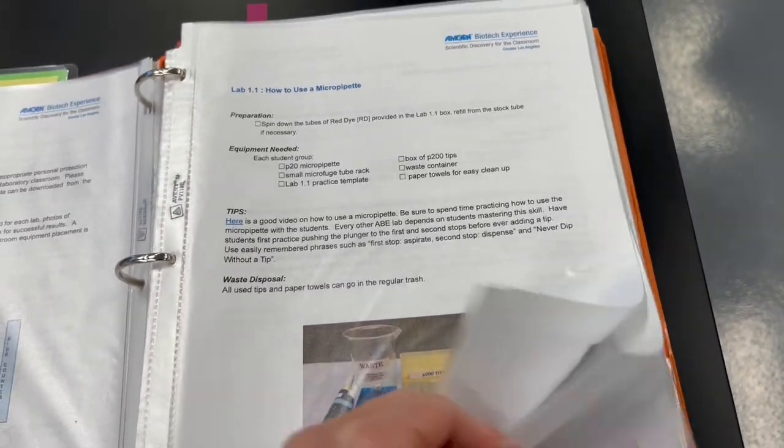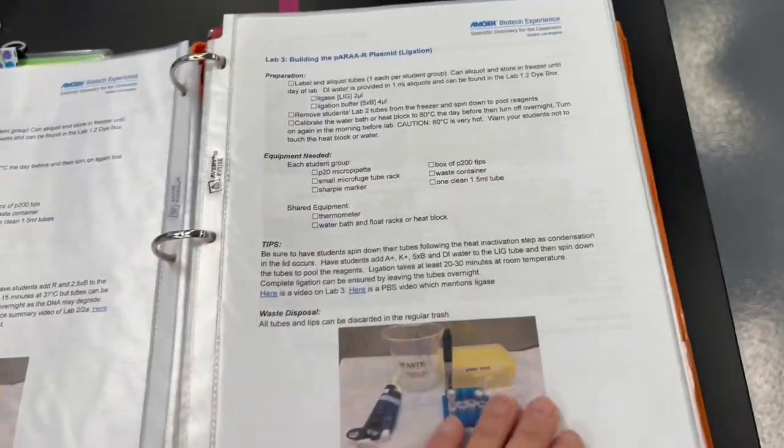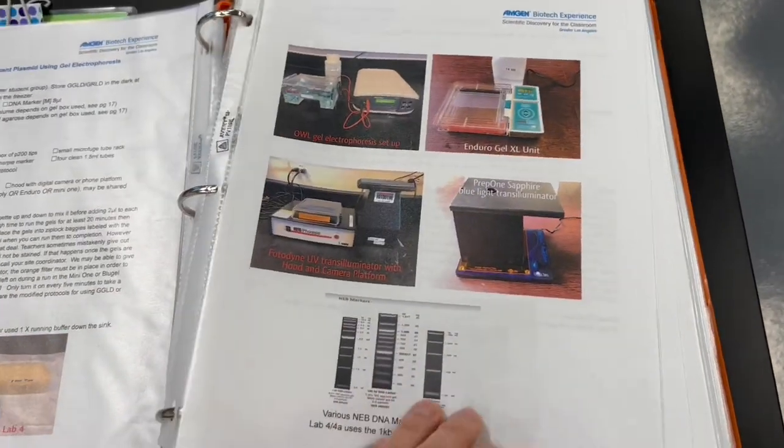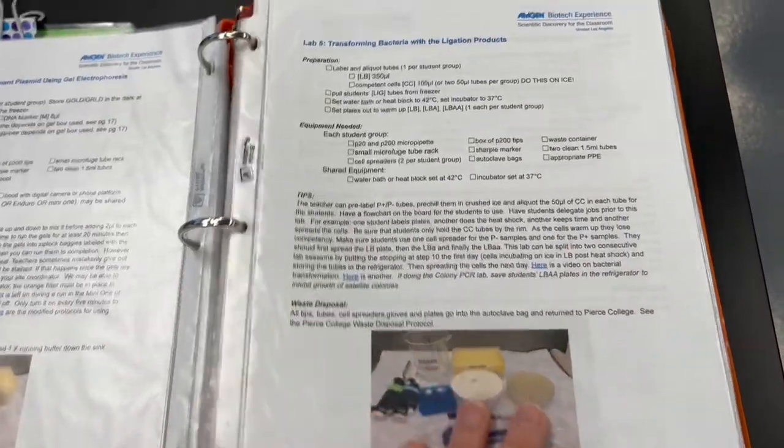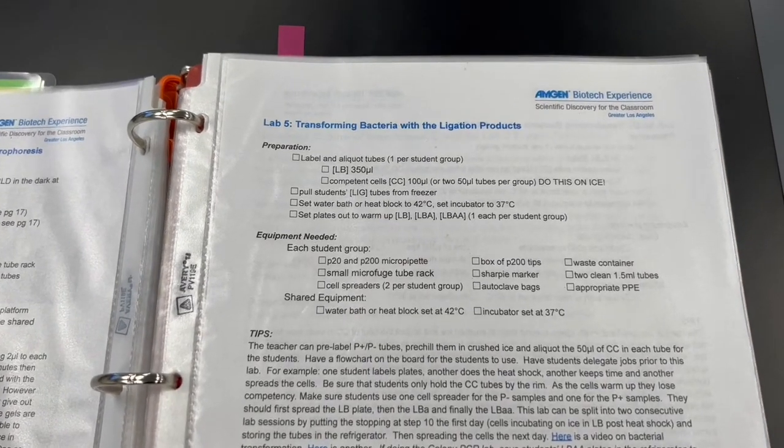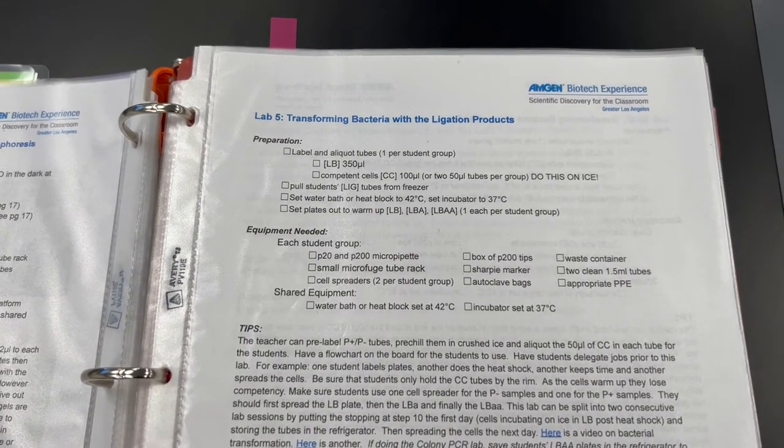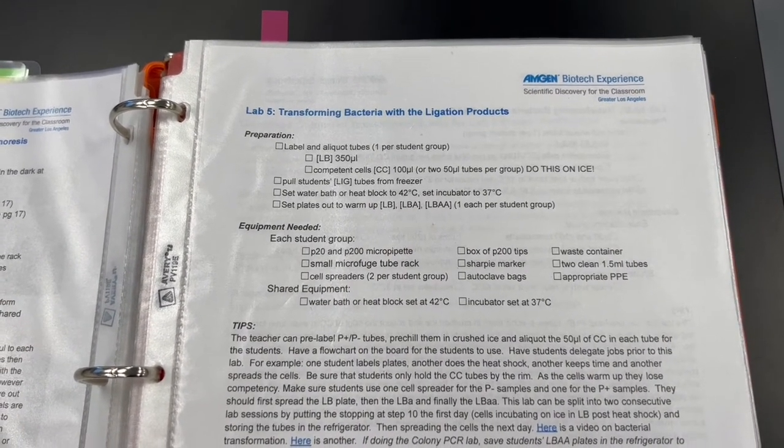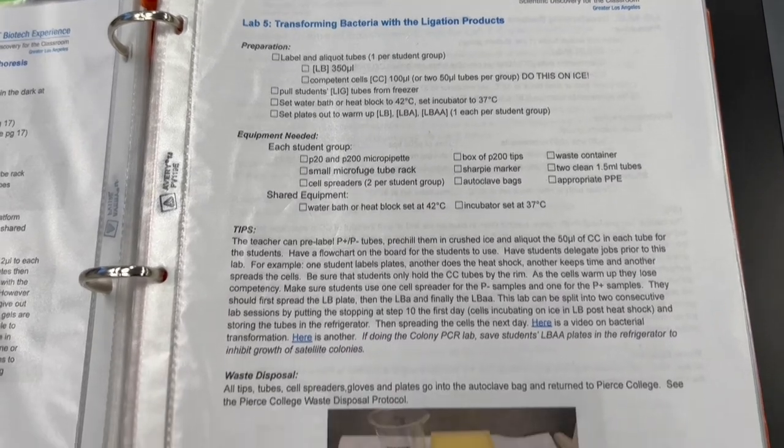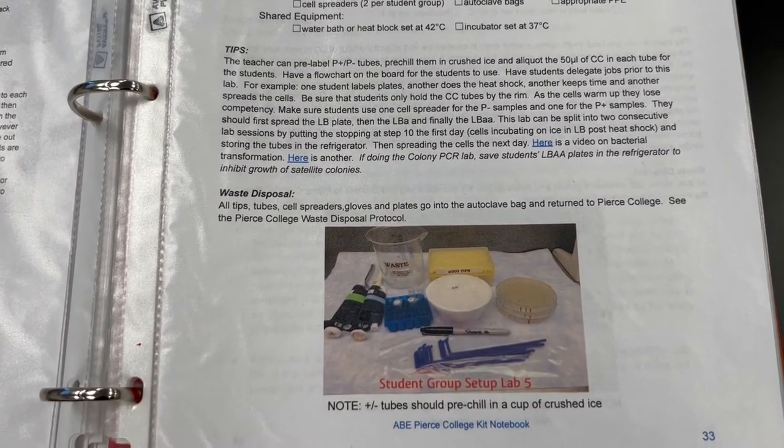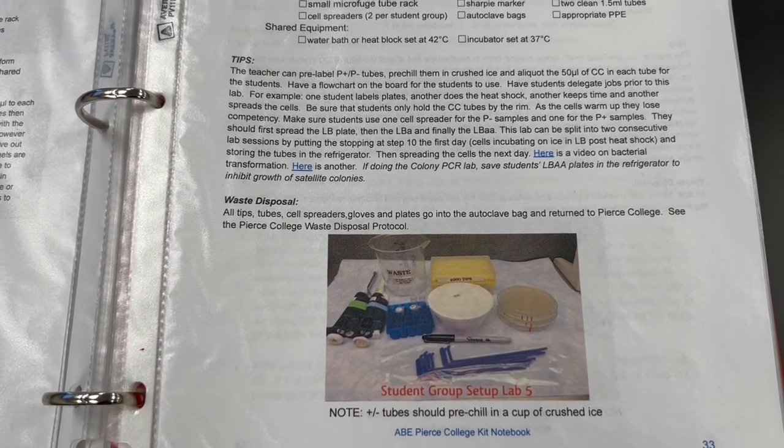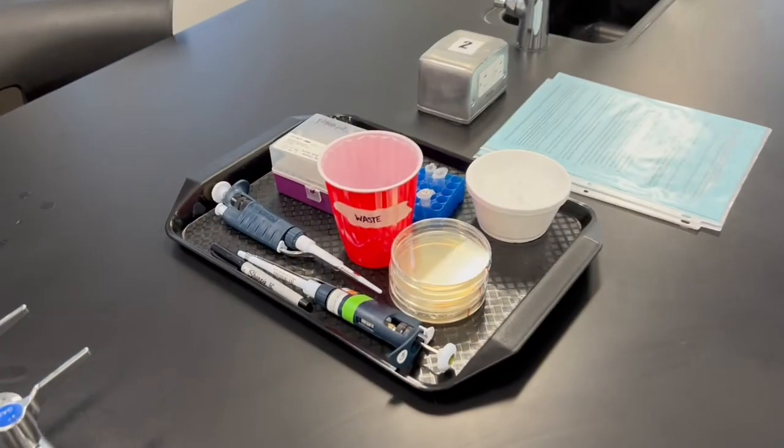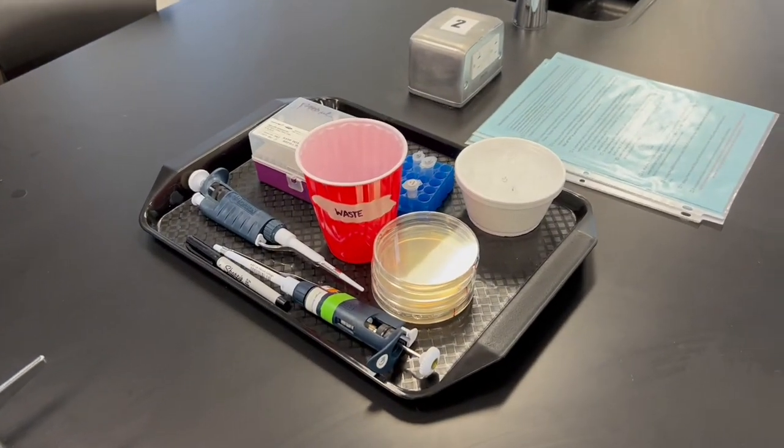For example, today I'm doing lab 5 and lab 5 tells you what's supposed to be at each lab station along with a picture and I can show you my setup for each of my lab stations. As you can see, I just follow exactly what's in that teacher manual.